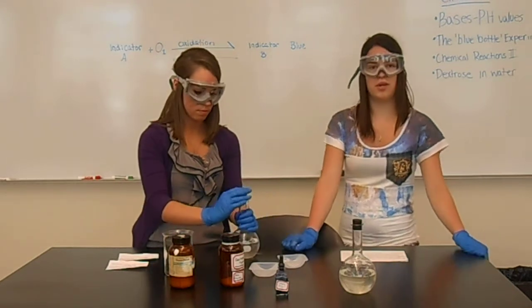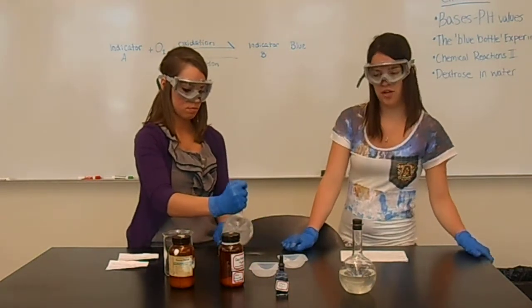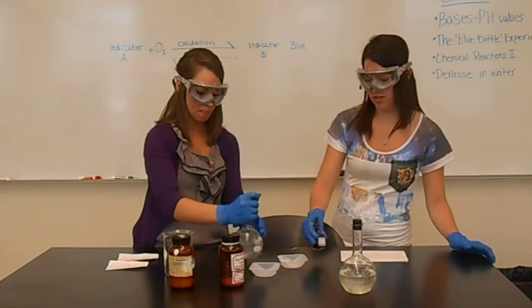After that is dissolved, we are going to add six to eight drops of the methylene blue indicator, and we chose to go in between, so we're going to do seven drops.